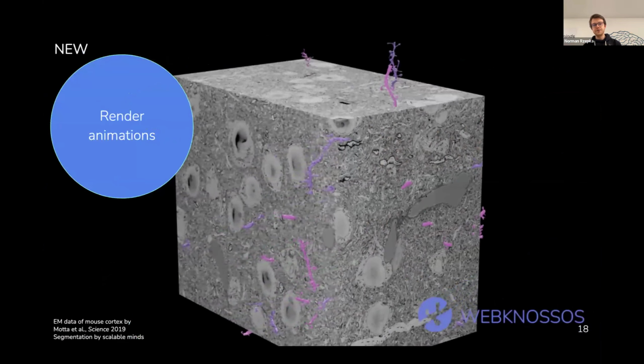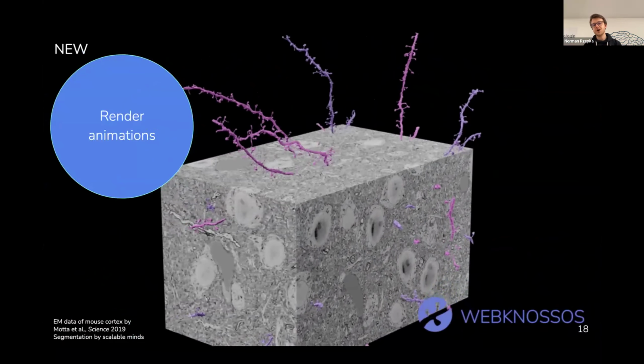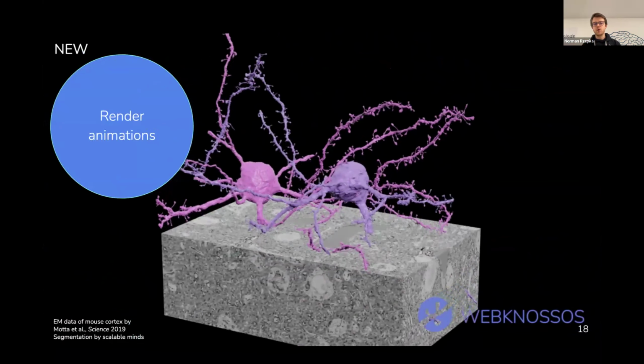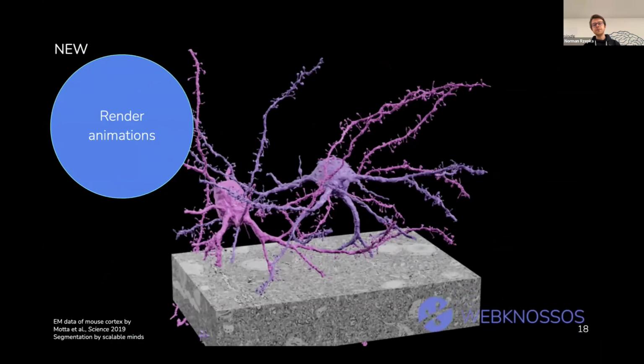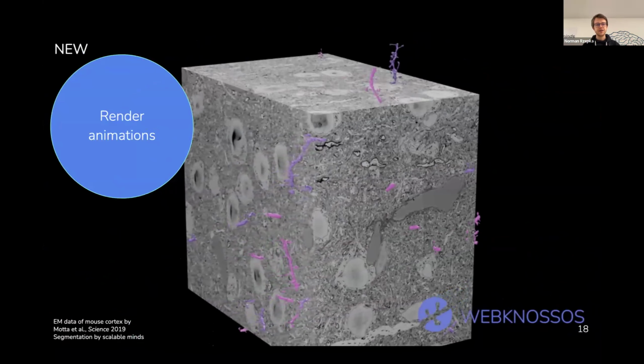WEBKNOSSOS also has an animation feature built in, so if you're happy with the presets that WEBKNOSSOS offers, then you can get an animation like this very quickly from WEBKNOSSOS, and that can be useful again for some presentations that you want to do.